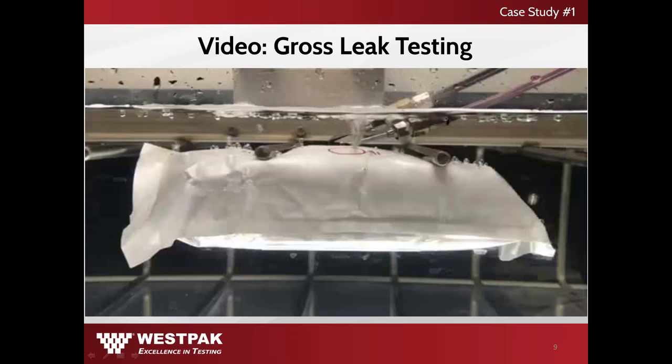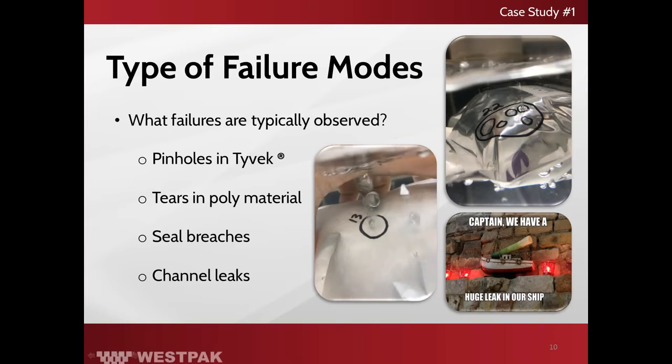This video here shows a leak on the Tyvek layer of the pouch. Because Tyvek is porous, bubbles will sit on the surface of the material. To correctly identify a failure, a constant stream of bubbles will be released from the punctured or breached area of the pouch. Common types of failures that are typically observed during gross leak detection include pinholes in the Tyvek material, tears in the poly material, as well as seal breaches and channel leaks.